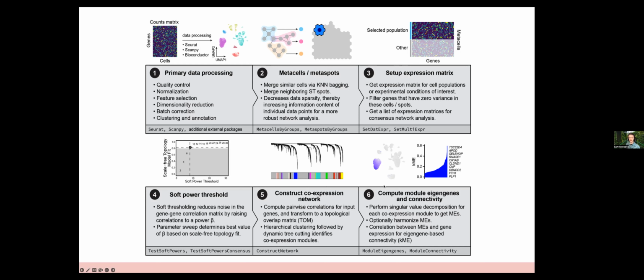And then the next thing we want to do is compute the gene expression for each of your co-expression modules. And the way that was done in the original WGCNA is by computing something called the module eigengene. So if you have your whole expression matrix like up here, we just take the genes from one module and then compute principal component analysis on that subset of your gene expression matrix with just those genes. And then the first principal component is called the module eigengene, and it represents the expression of that entire module.